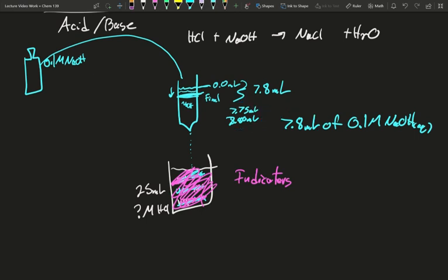That's where it's equal. So this amount of sodium hydroxide was necessary to react with the HCl in the original 25 mL in our beaker. Well, how much sodium hydroxide was that? 0.0078 liters of NaOH solution. I know in every 1 liter there's 0.1 mole. I knew the original solution was 0.1 molar. So the 0.00078 mole of NaOH was added.